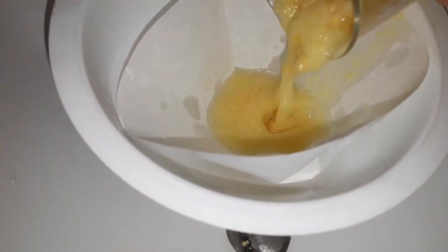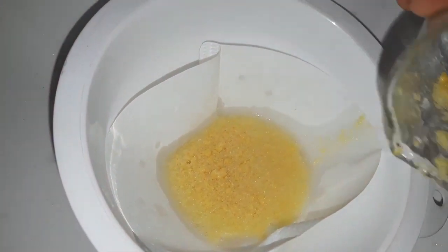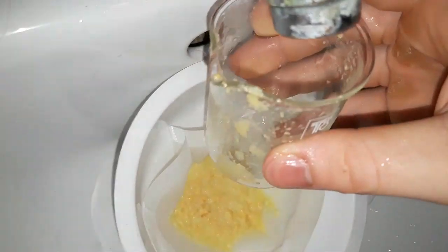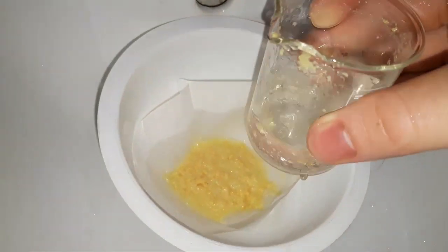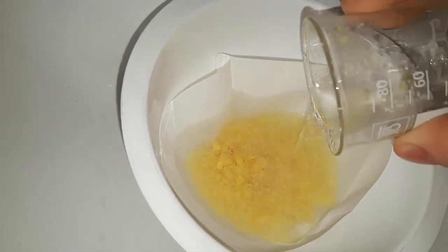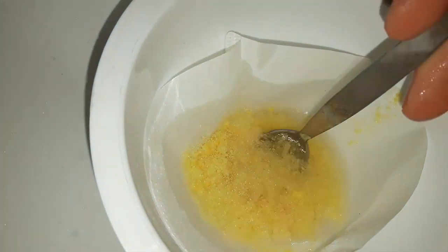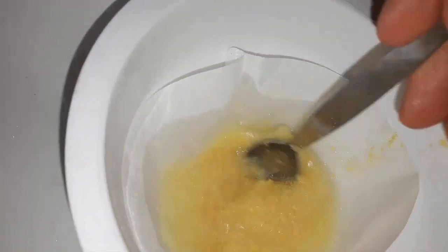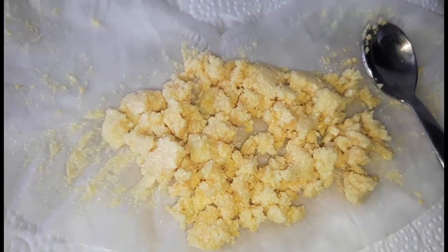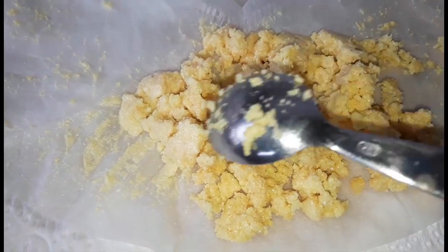Filter everything out and wash it with some cold water. We dried our product and we recrystallized it from boiling ethanol.